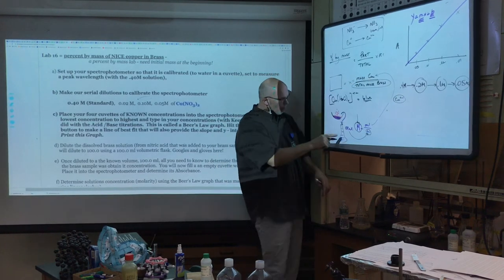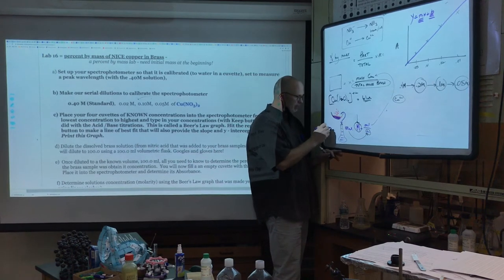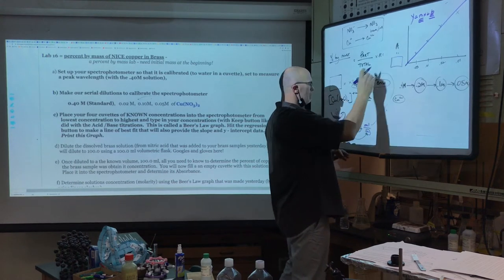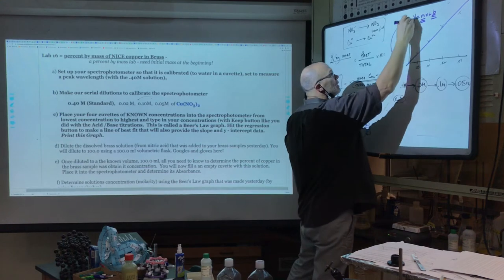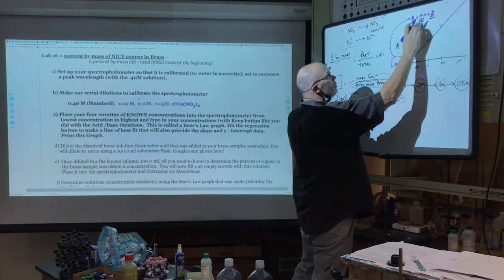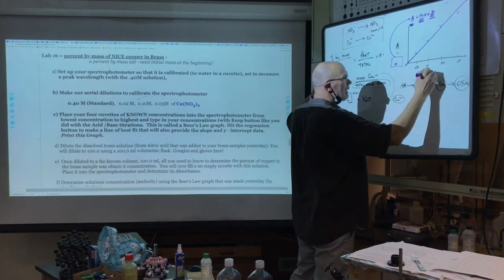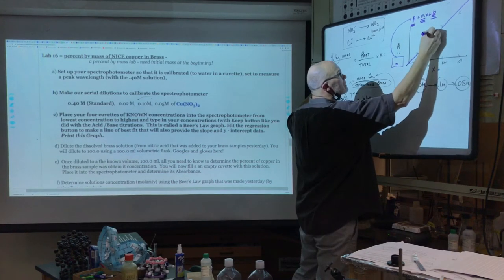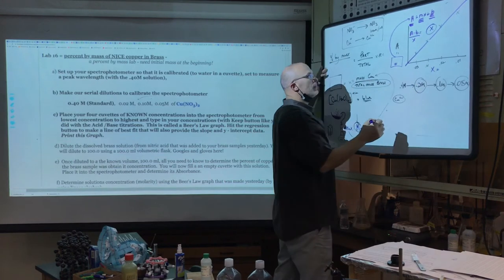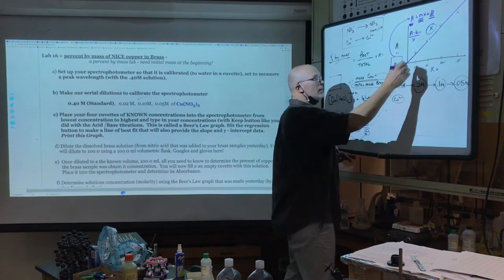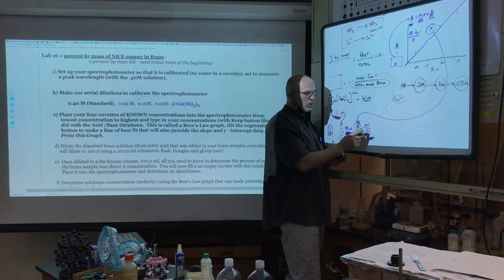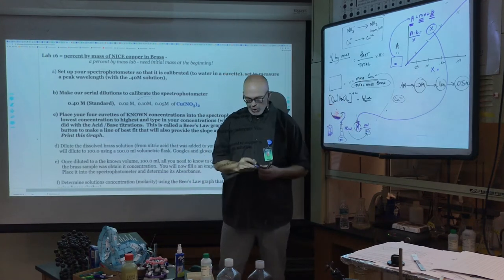Once the Beer's law graph is built, we pour a little of our unknown brass solution into a cuvette, run it through the spectrophotometer, and read the absorbance — that's our y. Using the slope m and y-intercept b from our known solutions, we solve for x: x = (y − b) / m. That x value is our molarity of the copper in solution.